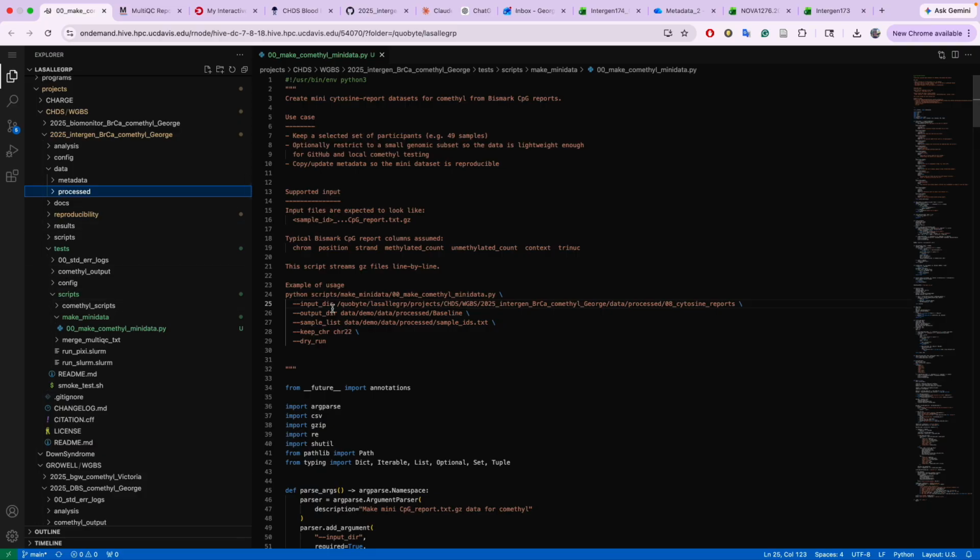Usually, if you remember, a path written like this without the forward slash is a relative path, and the script would only work if you are in the directory that is closest to this dataset. But I'm just adding the full path so that it doesn't give us errors.